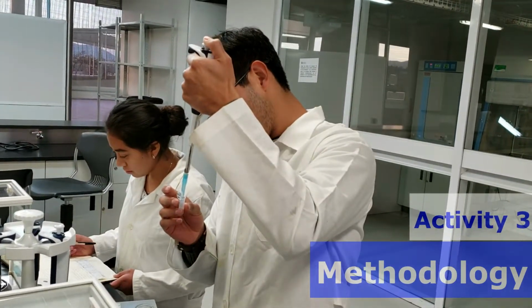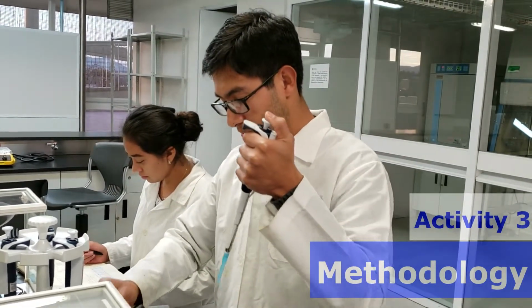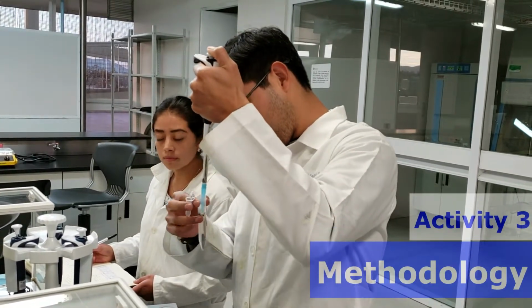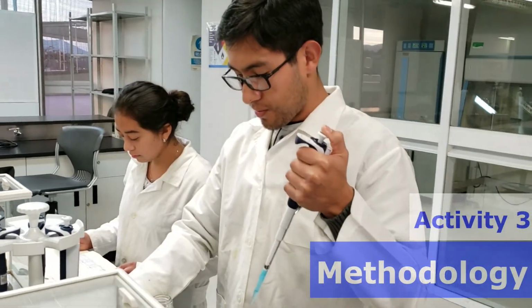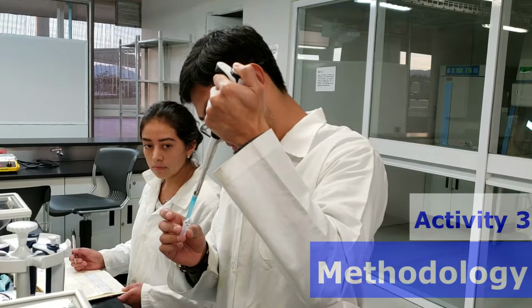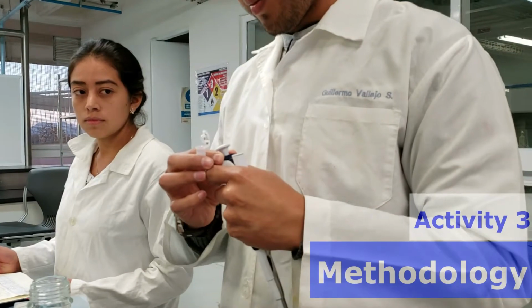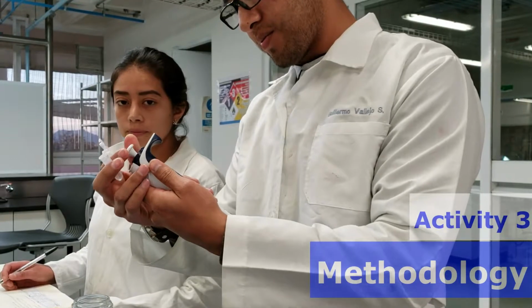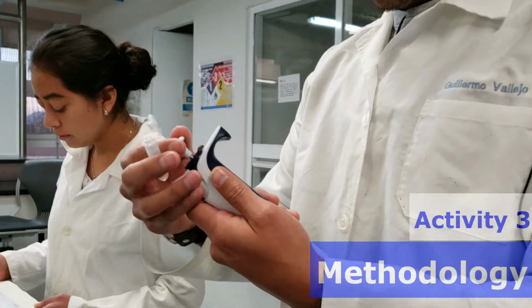It is also important to know the general data about the fluid you are going to work with, to use the best technique and minimize the error. For example, when a liquid is too viscous, such as glycerol, the air chamber of the micropipette cannot pull in the liquid easily. For better results, it's advisable to keep the micropipette tip in the liquid for around 3 seconds after the piston of the micropipette is completely released. This technique helps guarantee that the volume being recovered is close to the real volume.